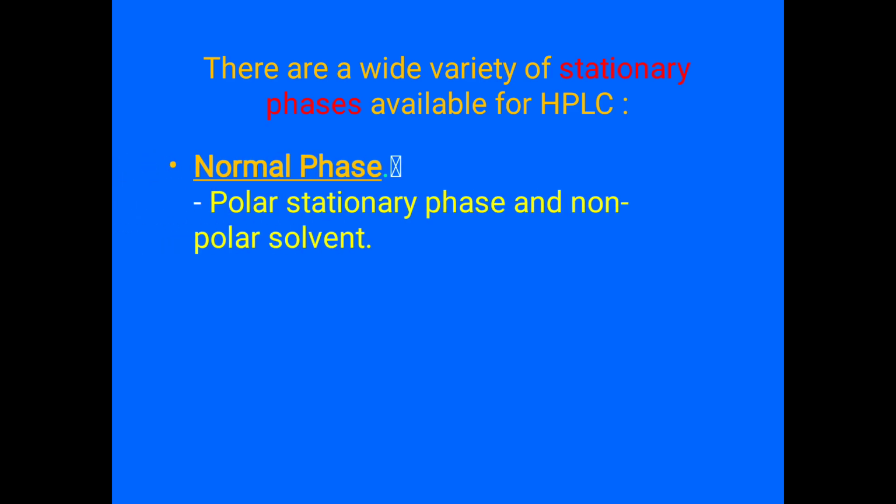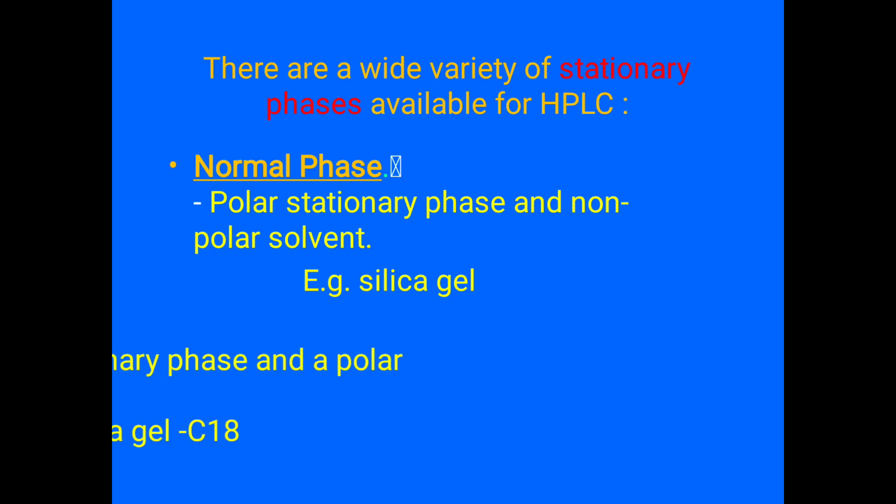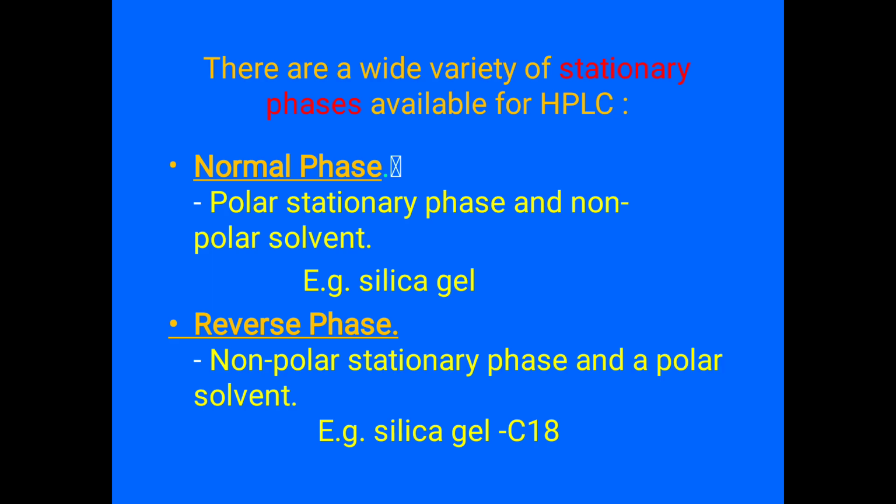Normal phase: polar stationary phase and non-polar solvent. Example: silica gel. Reverse phase: non-polar stationary phase and a polar solvent. Silica gel C18.